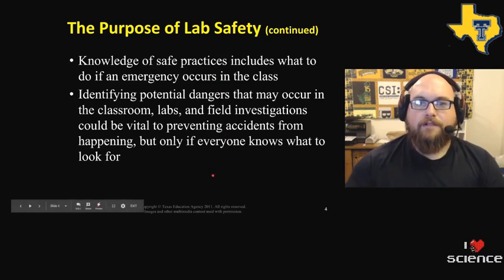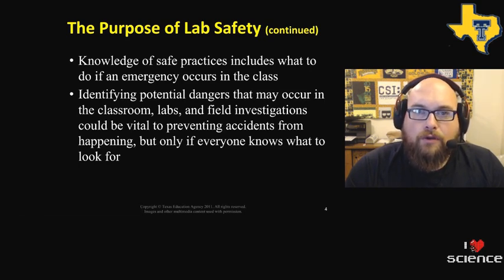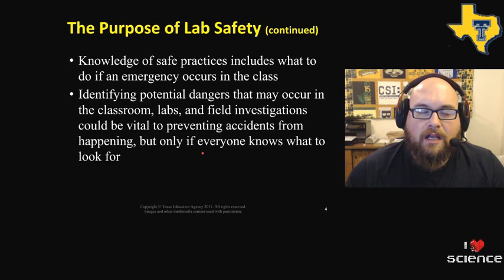The knowledge of safety practices includes what to do in emergencies. The more trained you are, the better and calmer you will be when a situation does arise, because accidents do happen. One of the things is that we need to identify potential dangers that can occur. A lot of this can be prevented if we wait for the safety briefing before every lab.